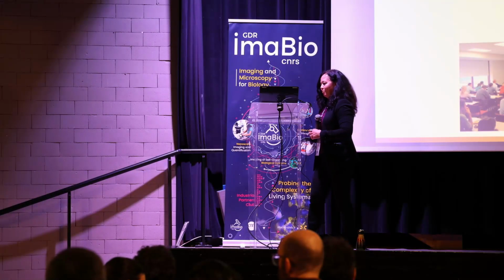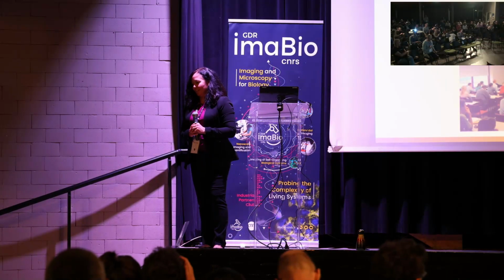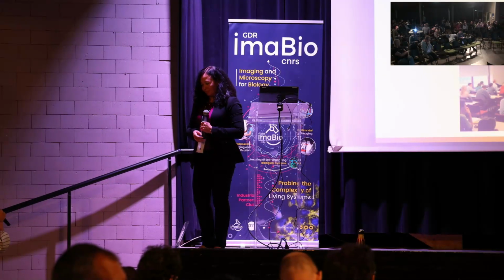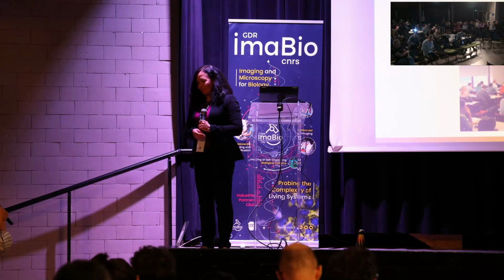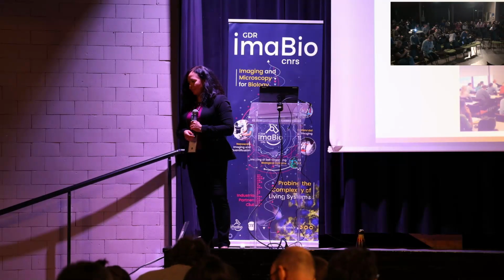I have a question regarding the bound and free NADH. You talk about the reactive oxygen species in the cell, and we know that regarding the microenvironment of the fluorophore, the lifetime will change.